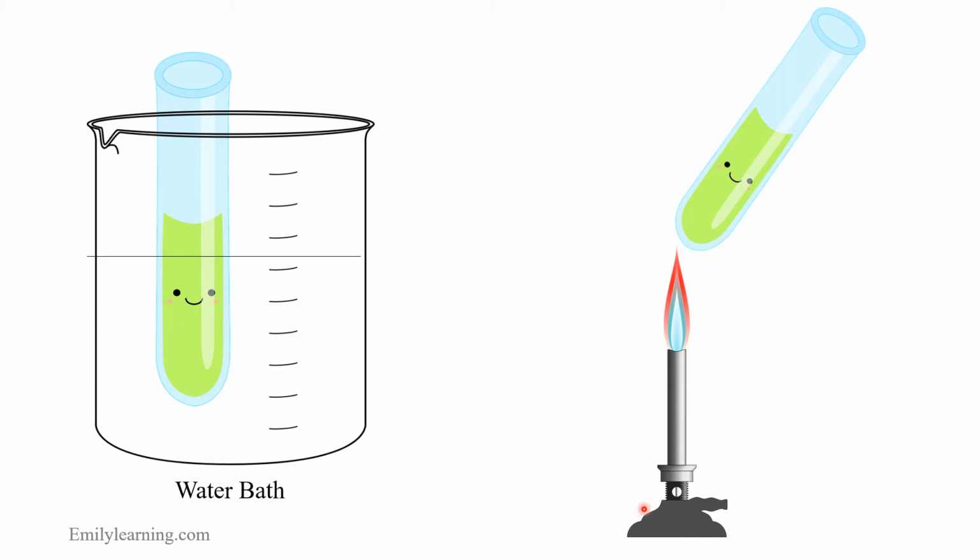But don't worry, if the question didn't ask you to put it in a water bath, most likely it is not so volatile, so it will be safe to do it this way. But if the question asks you to heat it in a water bath, please do it this way. Heat the test tube of organic compound over hot water, because we do not want to catch a fire during an exam. All right, so now I've talked about water bath.